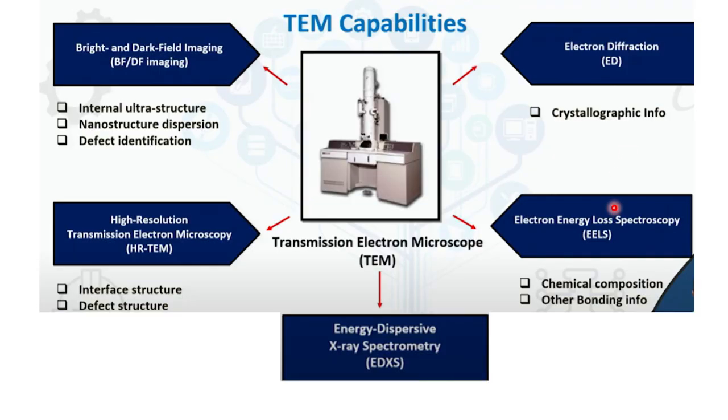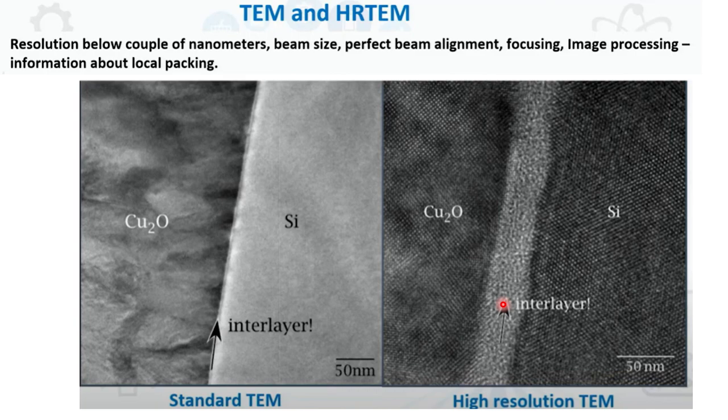And electron energy loss spectroscopy, EELS, can also be accommodated with TEM, and you can analyze chemical composition. Even in the biomedical field you can accommodate EELS, and of course EDAX also you can accommodate with your TEM machine.